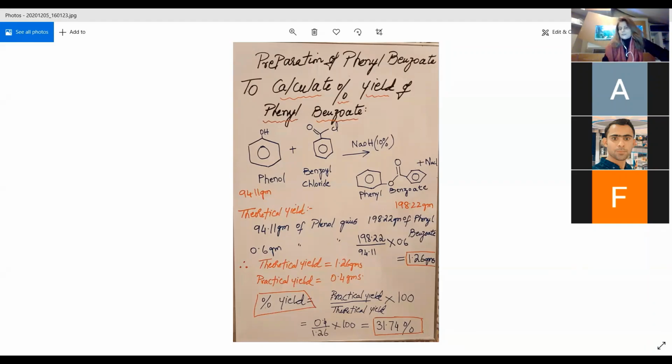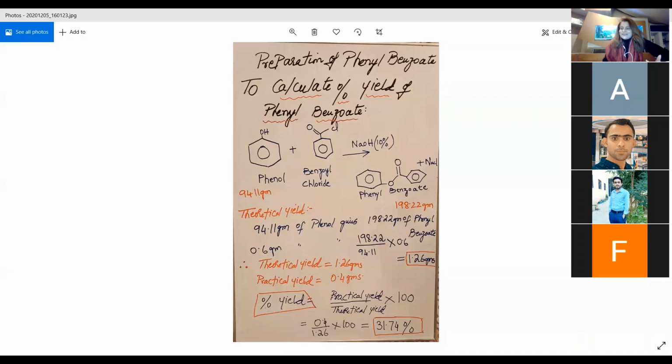What is a fume hood? Can somebody tell me what is a fume hood? F-U-M-E, fume, H-O-O-D. Have you ever seen a fume hood? No, ma'am. You have never seen a fume hood. I can't believe it. In the part 3 lab, you have seen on the right side, there is a wooden compartment that is always at the upper level, and we have to push it down. That is a fume hood, ma'am, for the exhaust in it.